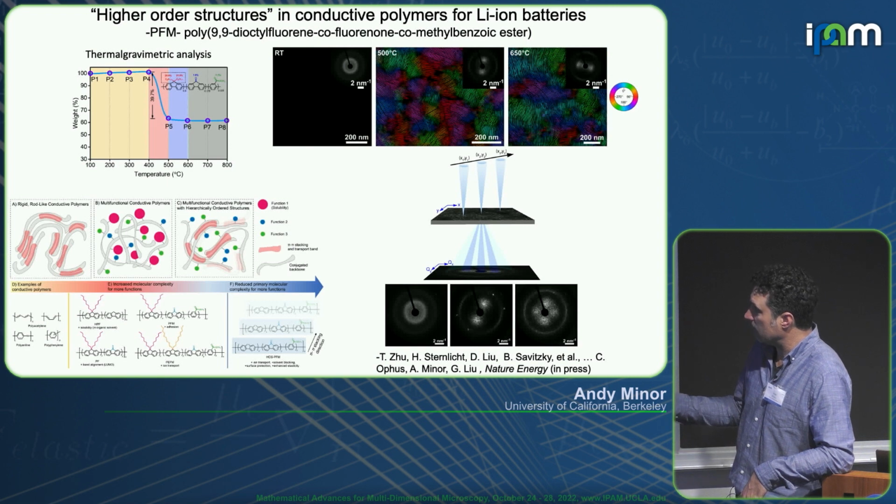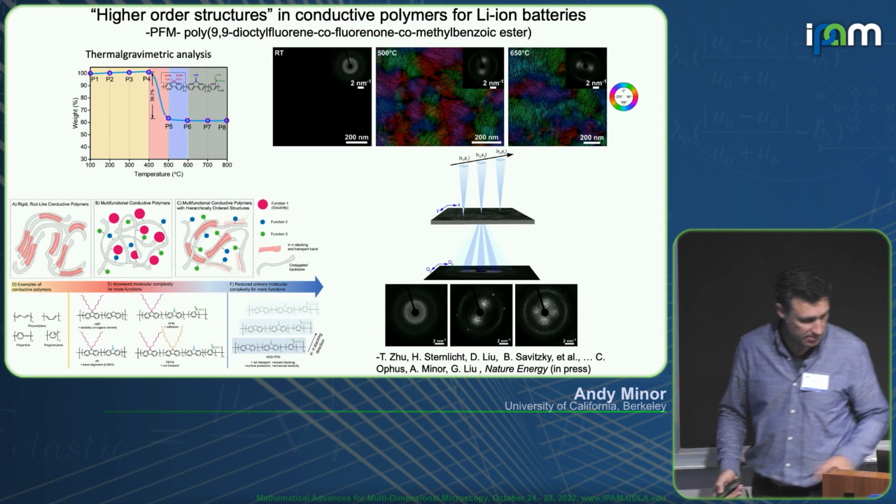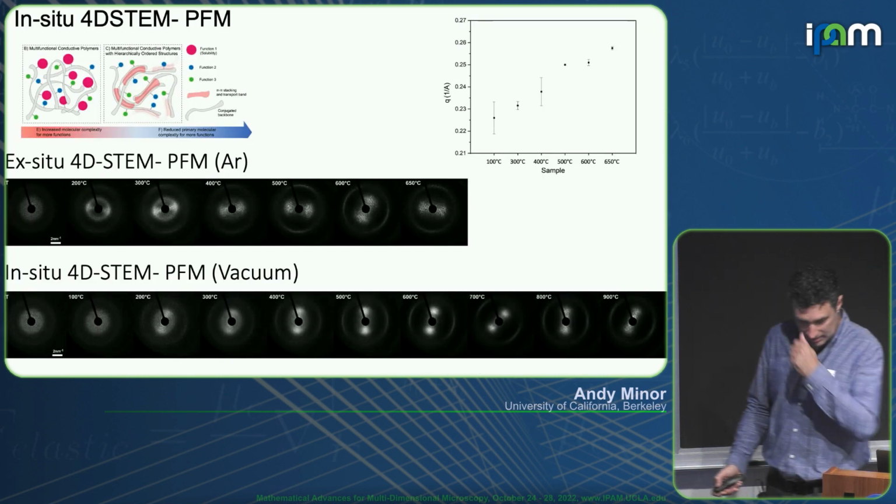As you start to anneal it at 500 up to 650, you see this crystalline blob type region start to appear. And here we're mapping the flow line basically just on the direction of these blobs, as shown here in this analysis.